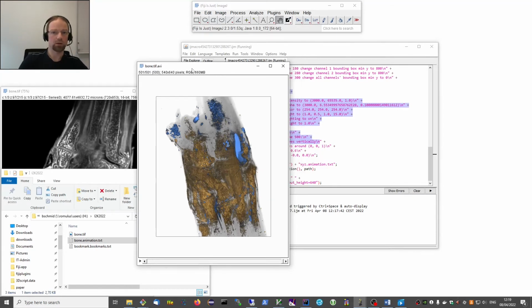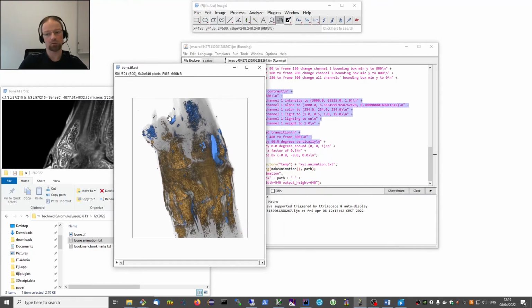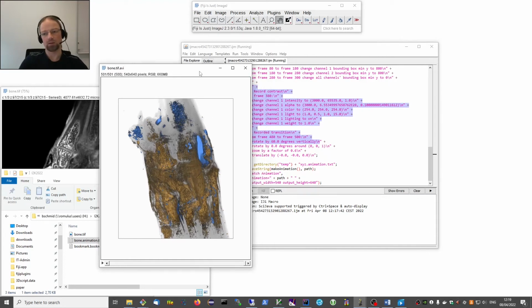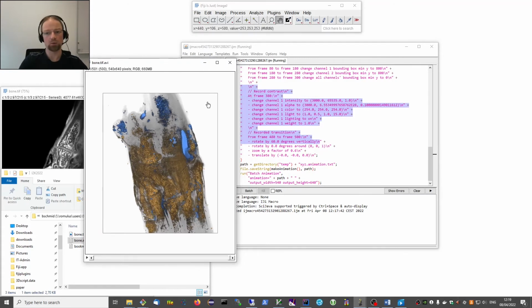And with remotely, I don't mean using screen sharing. Of course, you can always do screen sharing, but screen sharing might be a little bit laggy. I tried it myself, and it gets really annoying when you want to see the fine temporal transitions in animations. So screen sharing is maybe not the best, let's say. So we were thinking about how we can actually do this rendering remotely, and this is what I would like to show you in the remaining part of this workshop.